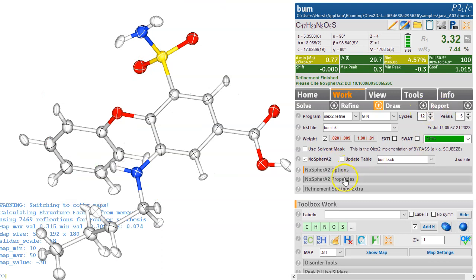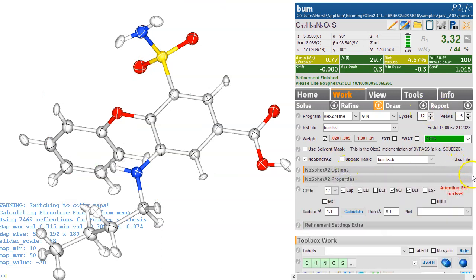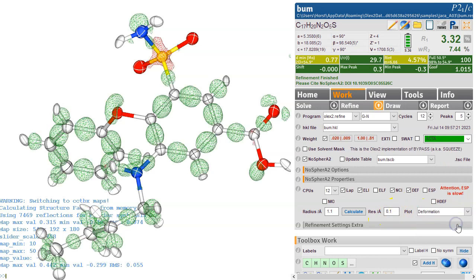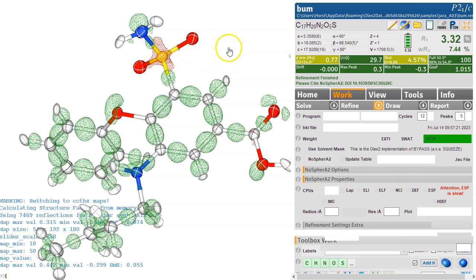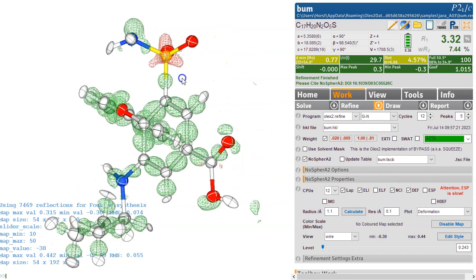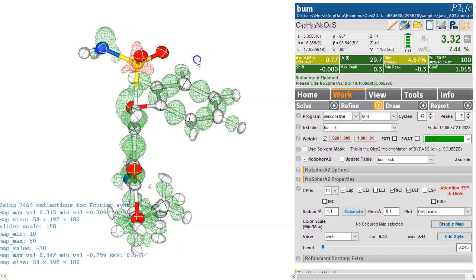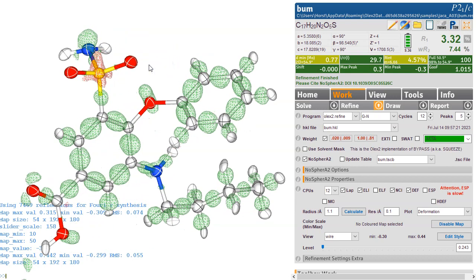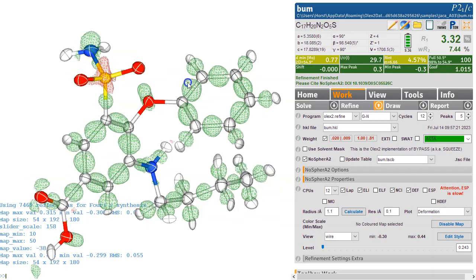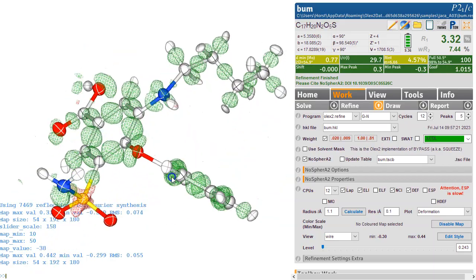And we can also look at things like the deformation density, which is the difference between the independent atom model, like the standard refinement, and the non-spherical form factor refinement. And we can effectively visualize where these orbitals are. So we can see what the independent atom model hasn't taken into account, that these non-spherical form factors now do take into account.